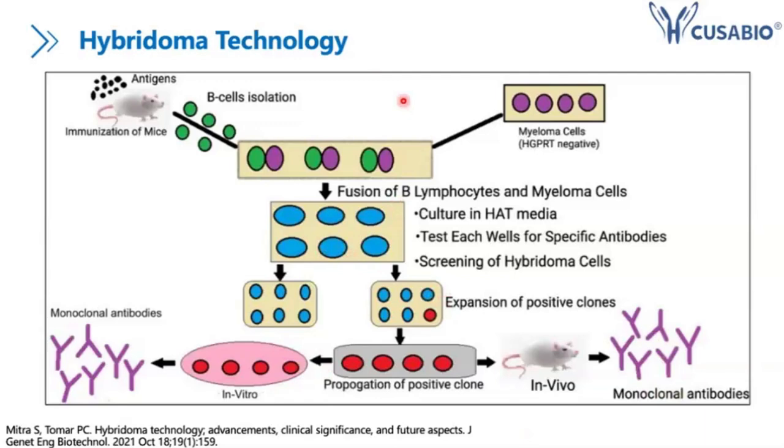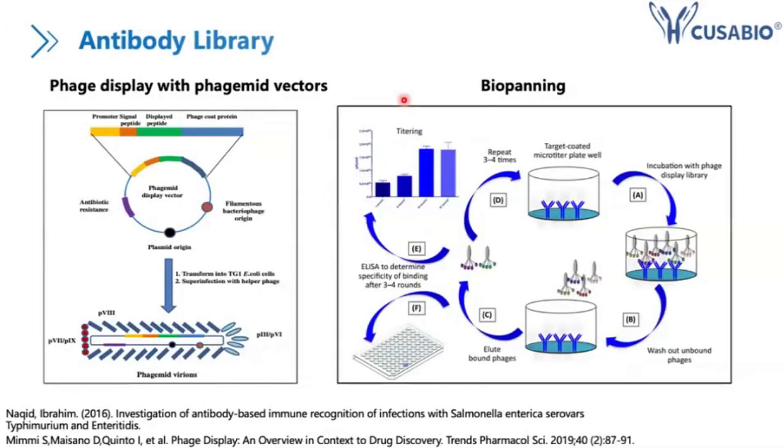With the antibody library, I think the key feature is that you can facilitate the selection of antibodies with prescribed properties. You are coupling the genetic information with the protein phenotypes, so it's a genotype-phenotype coupling together. So you can make different genetic modifications with the vectors. Then you will see the characteristics of the antibodies change.